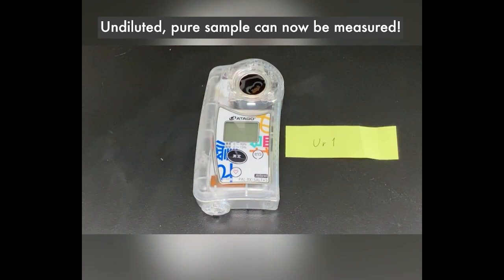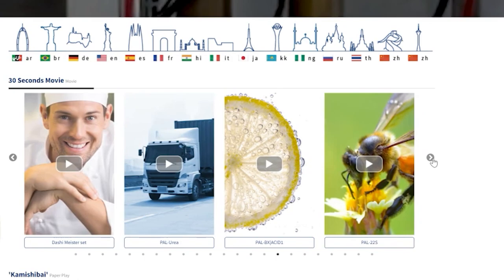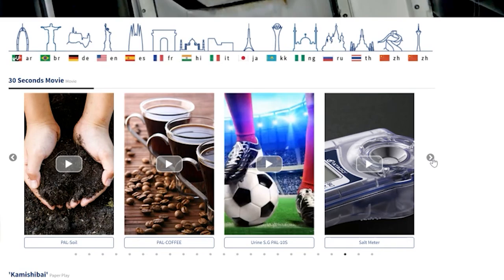Let's try it normally with the undiluted sample. Now, when you make a new batch of tare, you can quickly test it to make sure things are good before you start serving up your ramen. There's a lot of info over on Atago's website about this particular unit as well as all their other liquid testing devices.